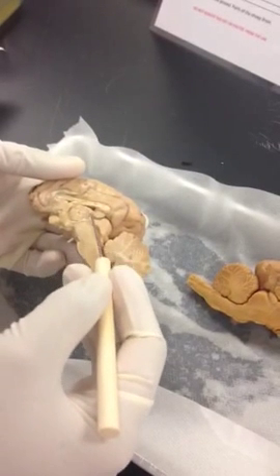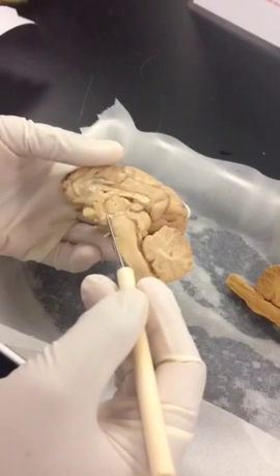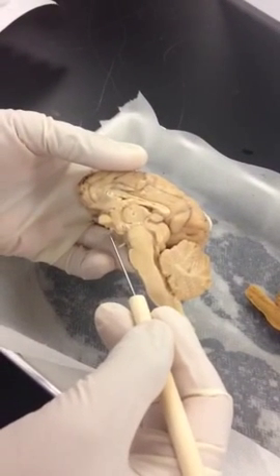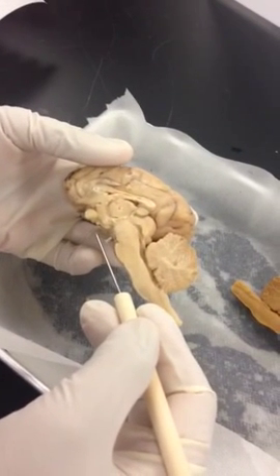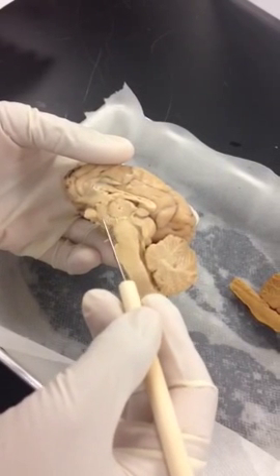So this is your thalamus. Right below the thalamus, don't go too far. Right below the thalamus, that's your hypothalamus. Again, don't go too far, then you'll be touching something else. Right below this line, you can see this area, that's your hypothalamus.